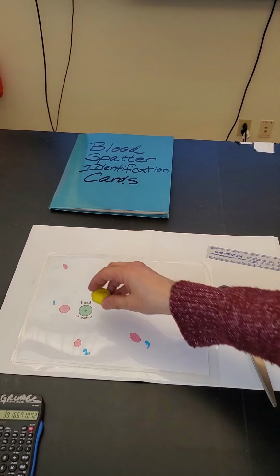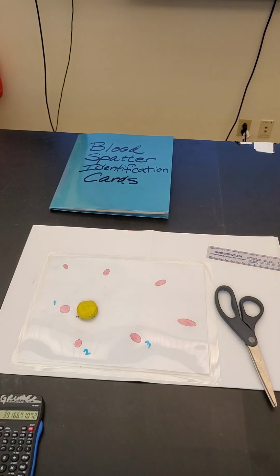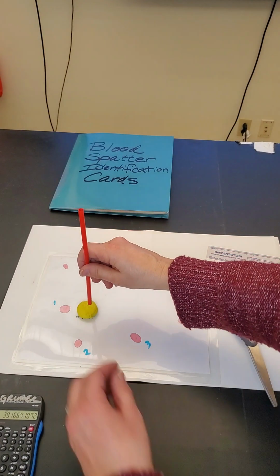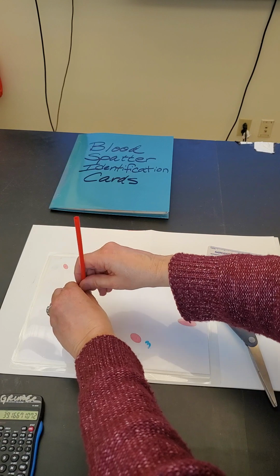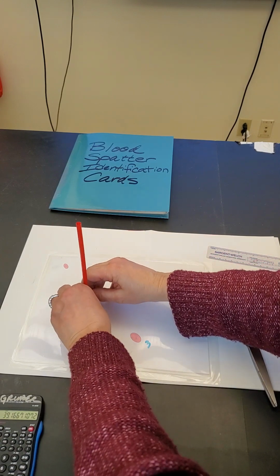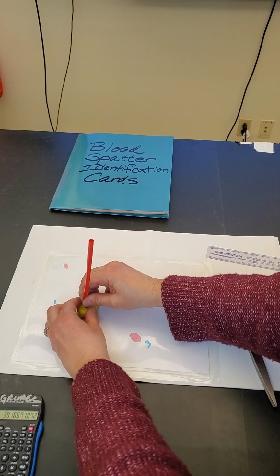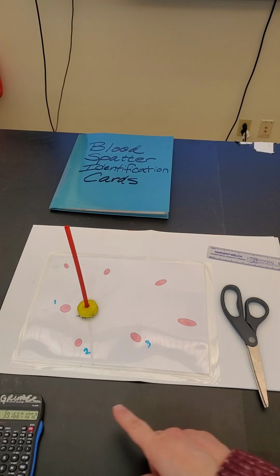Means, all right, we have the victim's head right there. That's where the victim was standing, somewhere in this plane. So I'm going to put the straw right in the middle. This is the person's height, representing the person, how tall they are. This is, I believe, Janie. So we said this was 39 degrees.